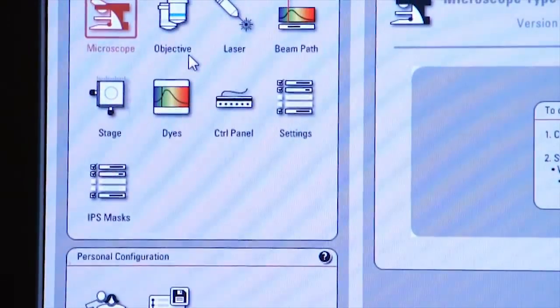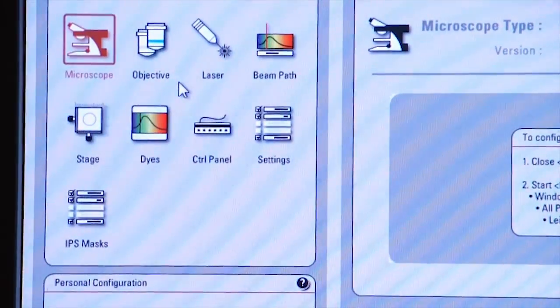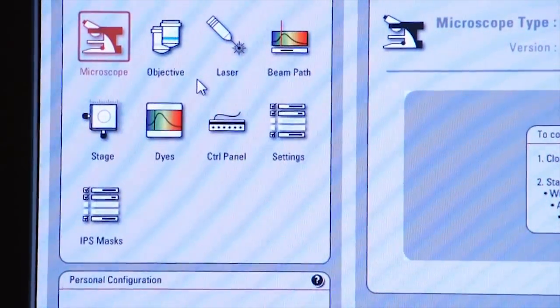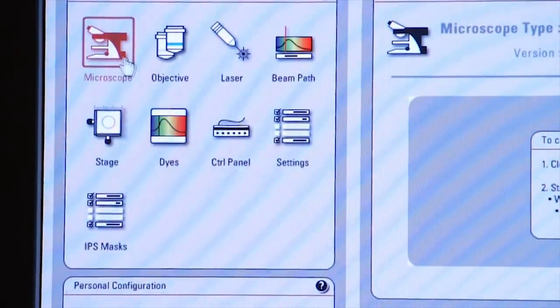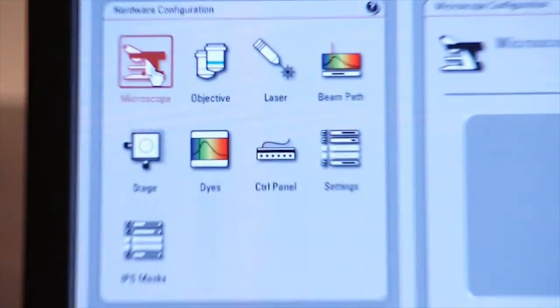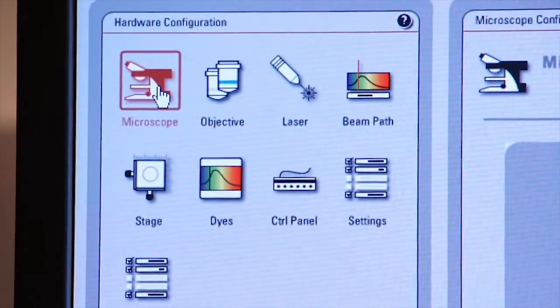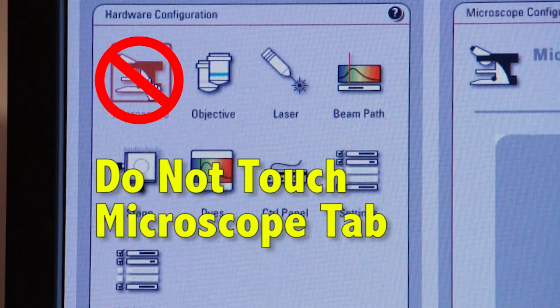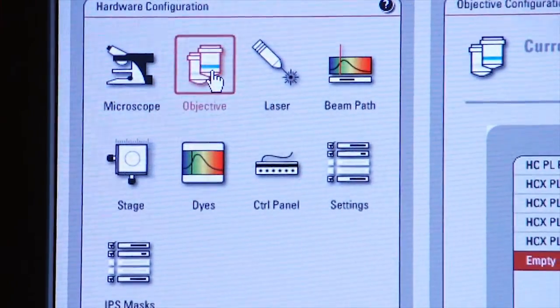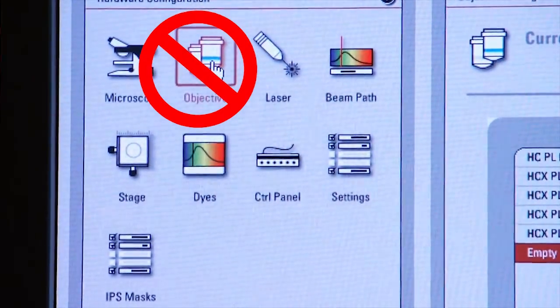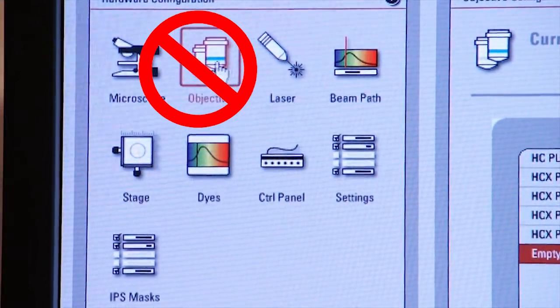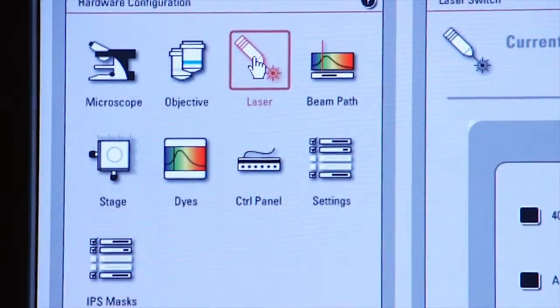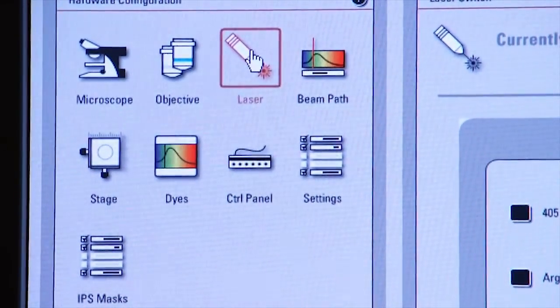These are very powerful. Some of these I want you to use, others I need you to stay away from. Do not activate the microscope icon under the configuration tab, nor the objective icon. Focus on the laser and click on that icon.